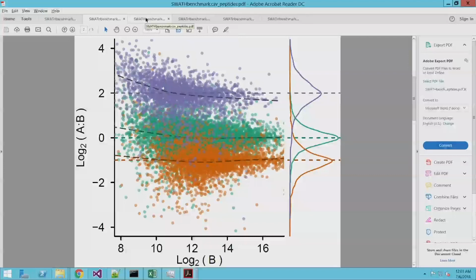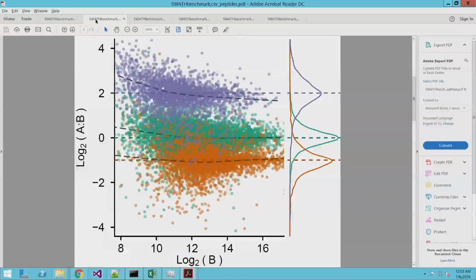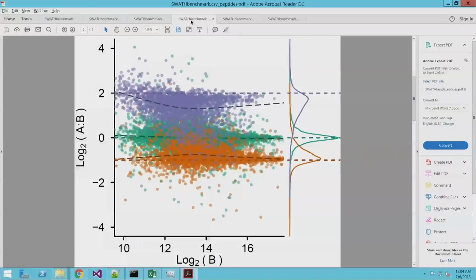And now this is 10 ppm, which I think is perhaps the best. You can see I'm very close to the line. This is basically the plot we're looking at. And you can see that I'm getting narrower data. You can see the dispersion of the data in this graph up here. And then if you go one more, this is 20 ppm. So this is what is suggested in the tutorial: use 20 ppm.